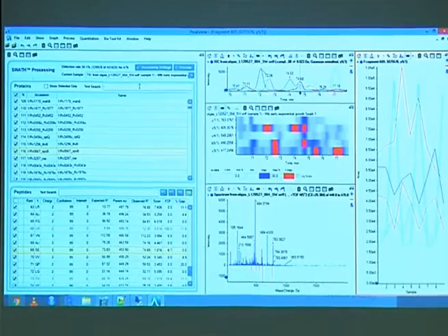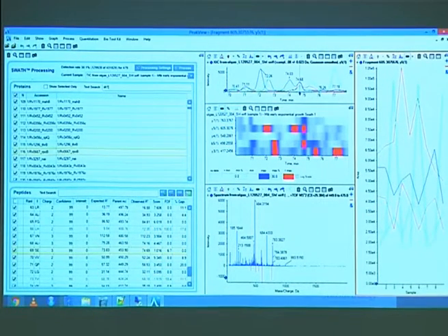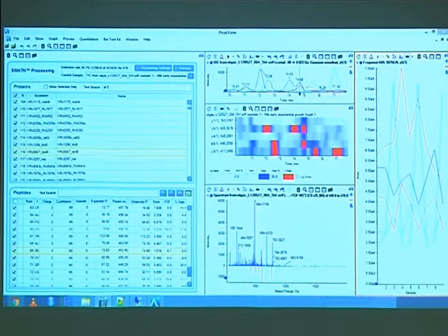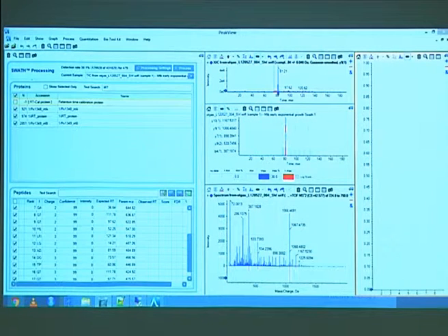We're going to look at some good results. What we're going to look at is the spike in peptides. Of these we do know they're in there, I mean, I've added them beforehand. So this is just a first control to see that everything worked the way it should have worked. There we go.